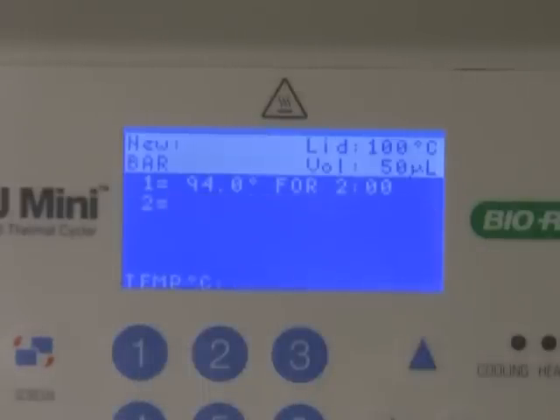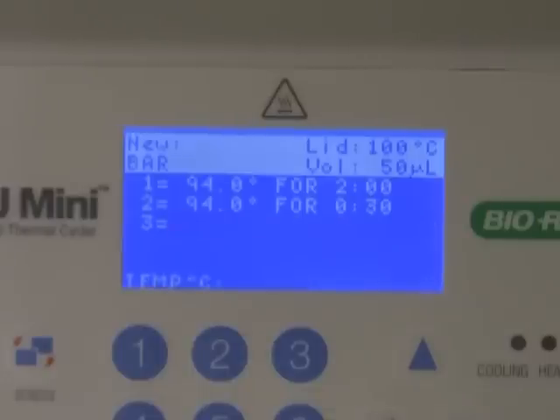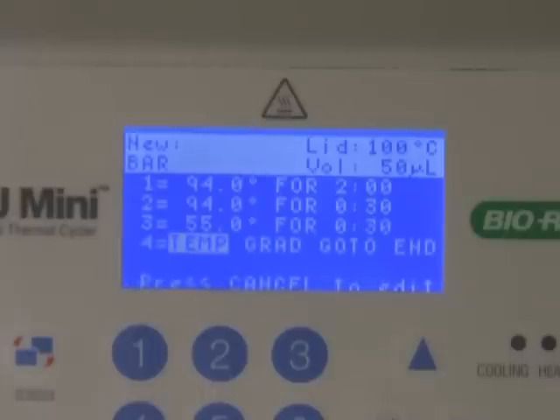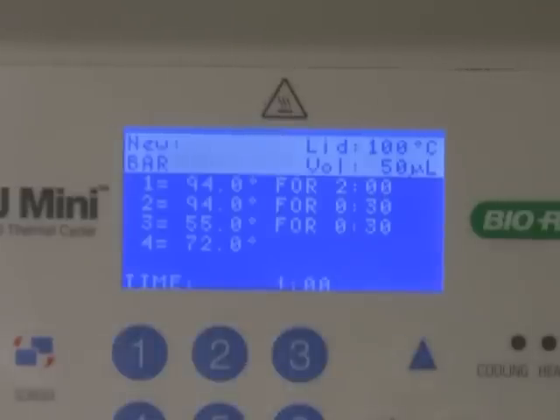Step 2 is 94 degrees for 30 seconds. This is the first denaturing step of the following cycles. Step 3 is 55 degrees Celsius for 30 seconds. This is the annealing step during which our primers are going to anneal to the template. Step 4 is 72 degrees for 1 minute. This is the extension step during which the polymerase is going to amplify our gene.